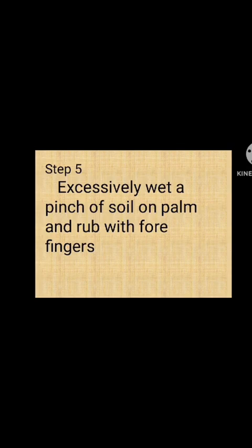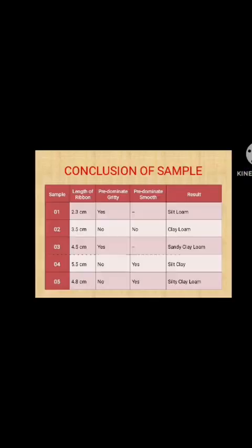Step 5 in the procedure. Excessively wet a pinch of soil on the palm and rub with the forefinger. Conclusion of soil samples. Here is the result given below in the table.